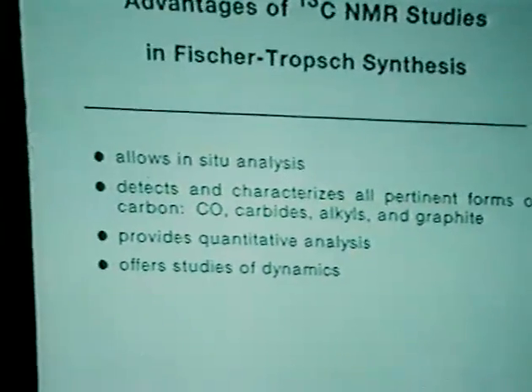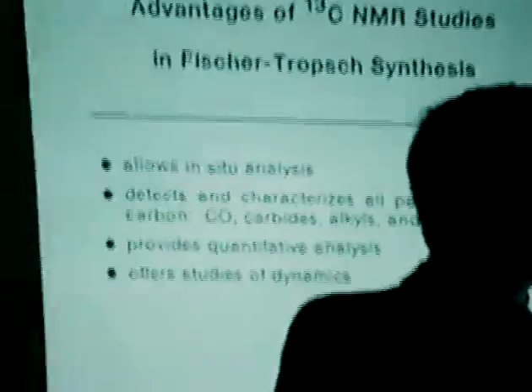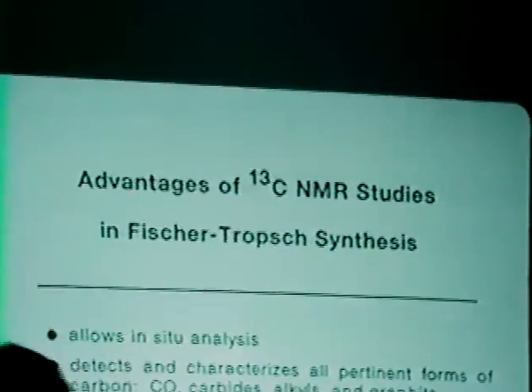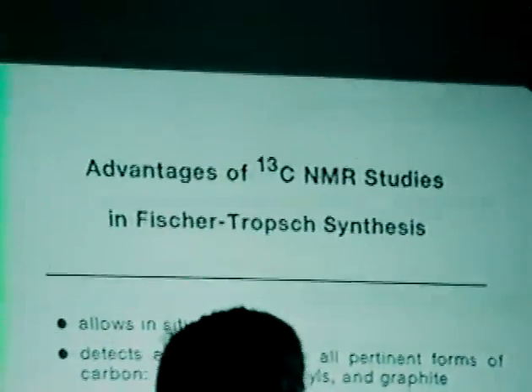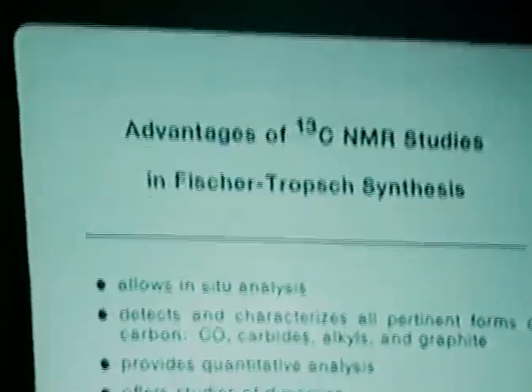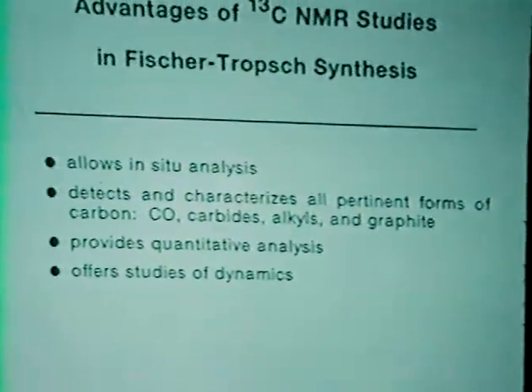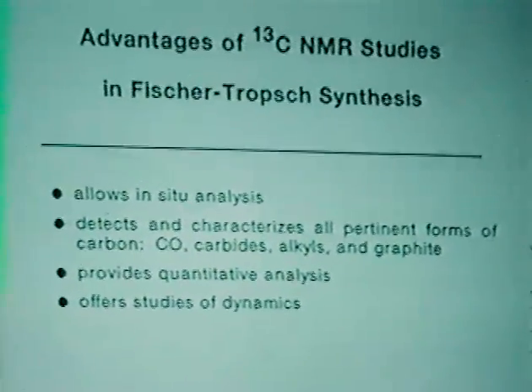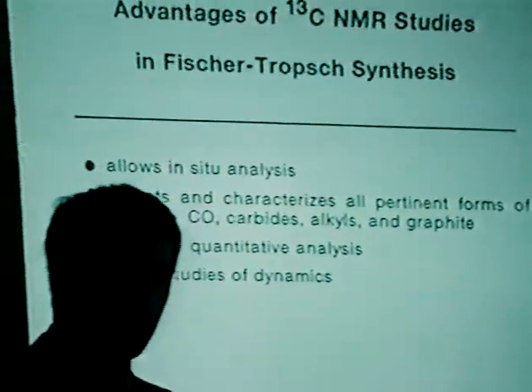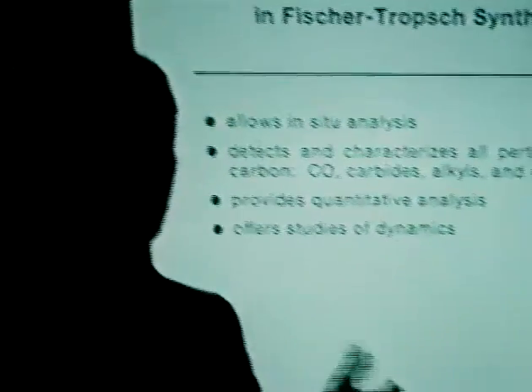Now, if this is really true, if these things really can say that much, then why hasn't the NMR gone much farther than it has in the years since we did these initial studies? The only work that I know of going on in this area is Alex continuing his studies with his group at Berkeley. So either these claims are false, that it really doesn't provide this information, or there's perhaps some other reason. Is it because the NMR is perhaps difficult to get going in one's lab? Is it that no one believes these results? Is it that the equipment is expensive?